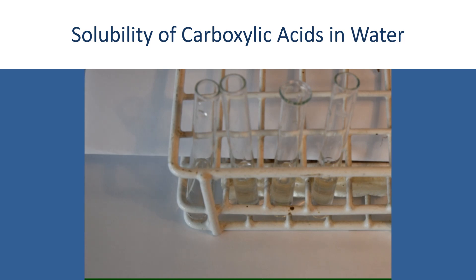I'm going to add firstly methanoic acid to the first test tube, ethanoic acid to the second test tube, propanoic acid to the third test tube, and finally butanoic acid to the final test tube, and we're going to see if we can see a trend in the solubility of these carboxylic acids.